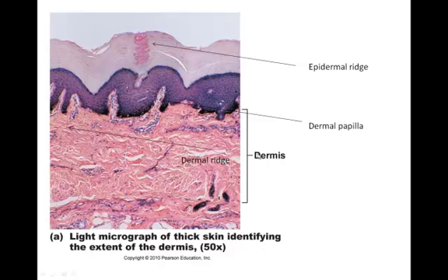But then we have our dermal papillae. Papilla is singular, papillae plural. So these papillae are those nipples that stick up in the keratinized stratified squamous epithelium layer. So remember, this is our epidermis up here, and this is our dermis down below. So these are the dermal papillae here. This is that areolar connective tissue. See this areolar connective tissue?